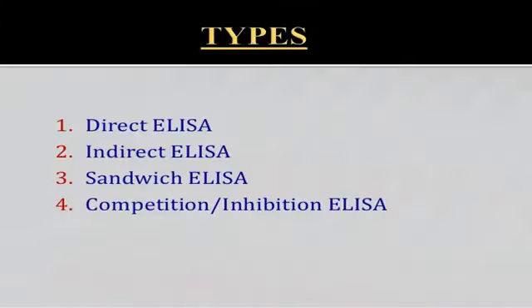We will discuss one by one each of the 4 types of the ELISA technique: direct ELISA, indirect ELISA, sandwich ELISA, and the competition inhibition ELISA type.